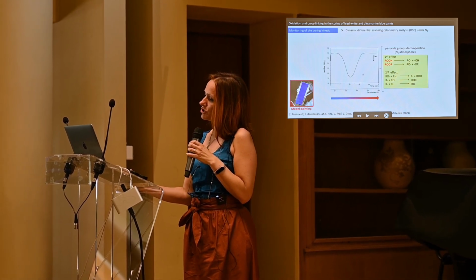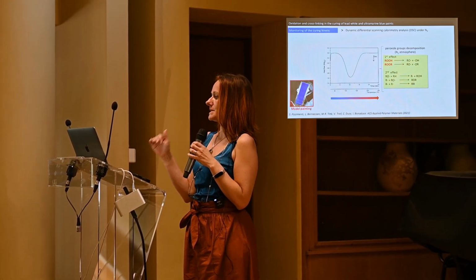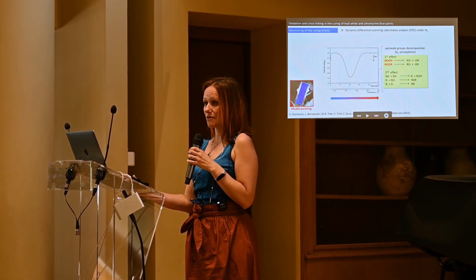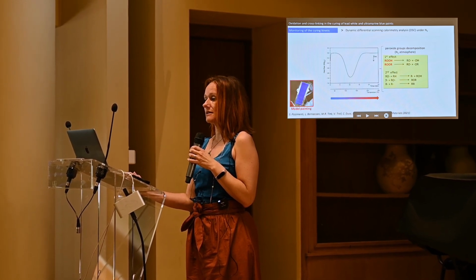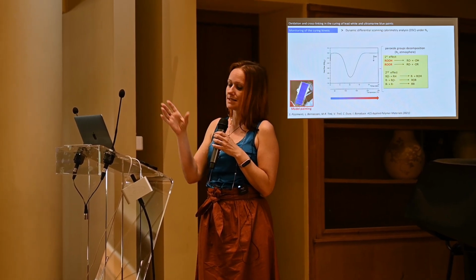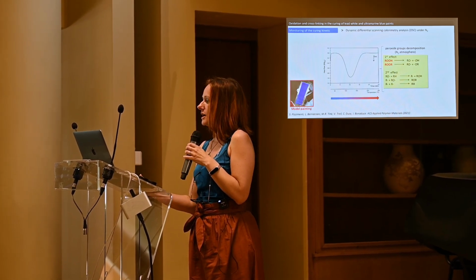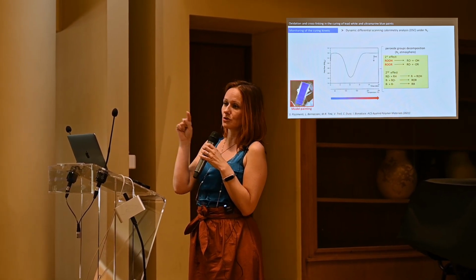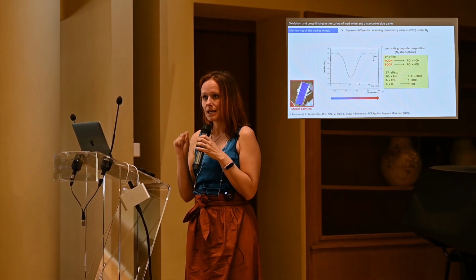This peak is due to the superimposition of two phenomena. The first phenomenon is endothermic, actually, and is due to the thermal decomposition of peroxide species. The second phenomenon instead is exothermic, and is due to the recombination of radicals that are present in the paint layers and those that derive from the decomposition of peroxide species. The overall effect is exothermic, and the area of the peak is proportional to the concentration of peroxide species and active radical species in the paint layer.